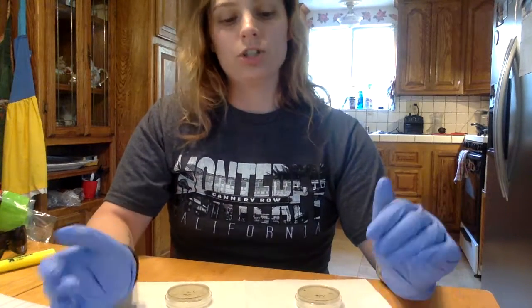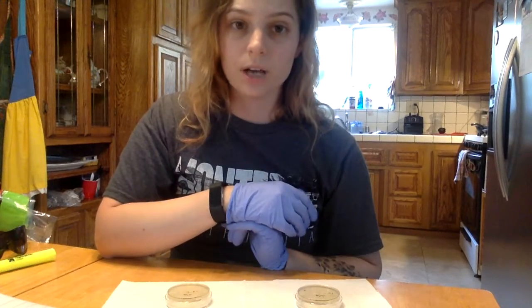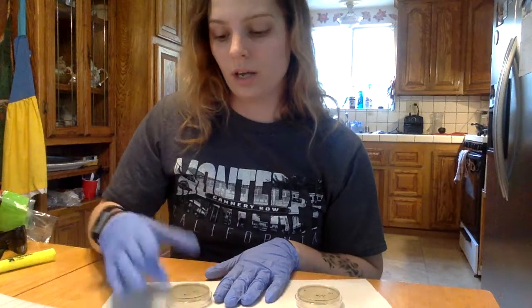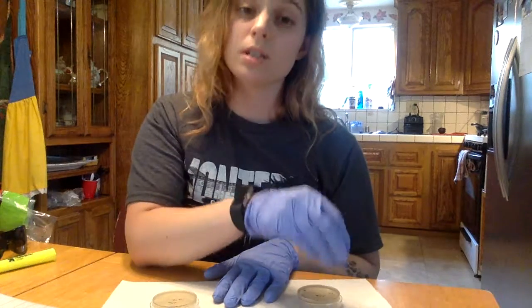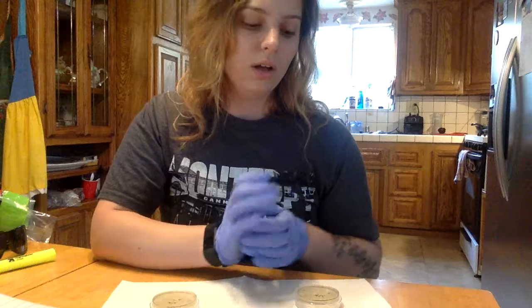So this just shows that as scientists, you have to repeat experiments multiple times if you have a hypothesis that you want to test. Again, I'm not very happy with this result, but I'm glad to hear from the professor that I am seeing growth, it's just not enough to match the instructions for the 30 to 300 CFU goal.